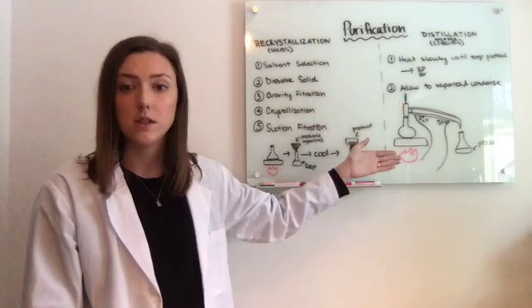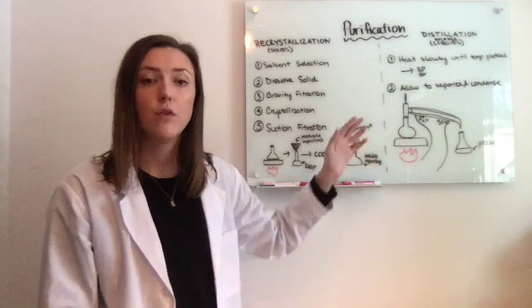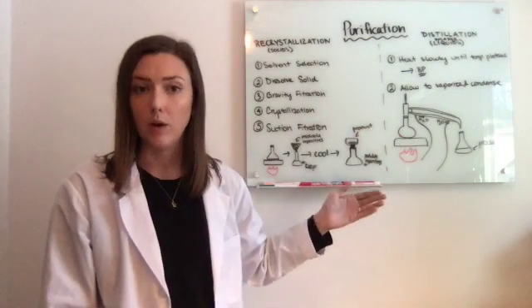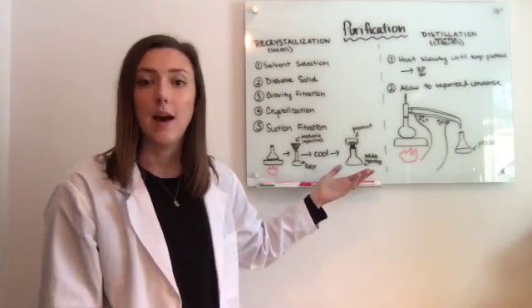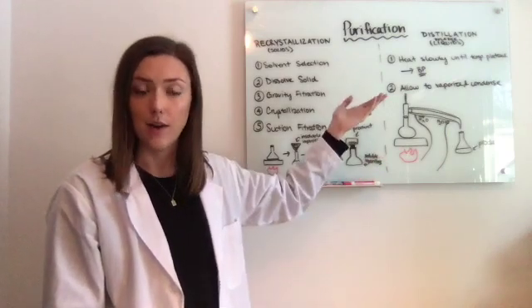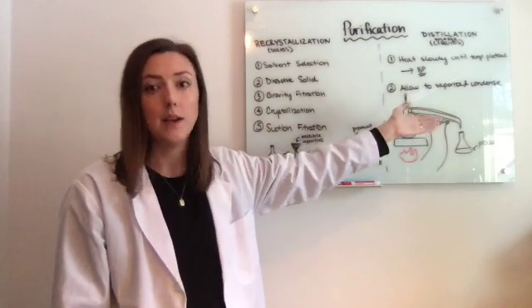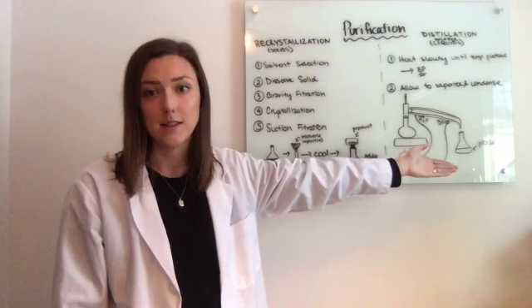So you're going to really slowly heat up the solution, and then when the temperature plateaus, first of all, it's really important to note that that is going to be the boiling point range for your liquid of interest. And because it's the boiling point, at that point it is going to vaporize out of the solution and will be directed into the condenser, where it then recondenses into a liquid and can be collected in its pure form in the flask.